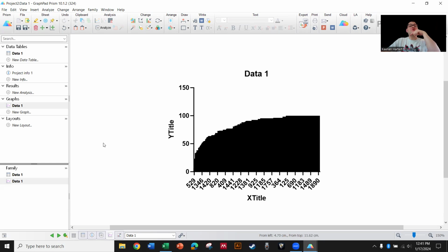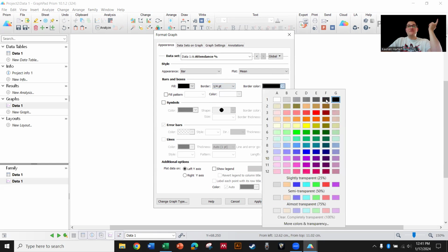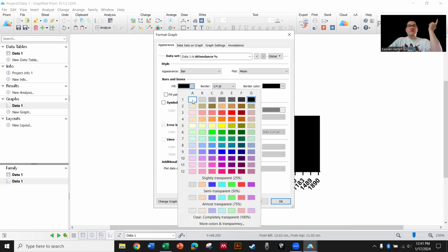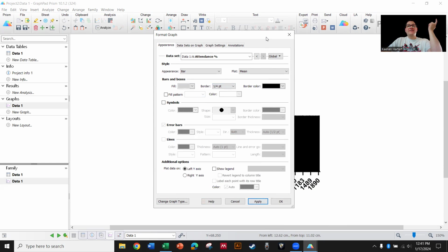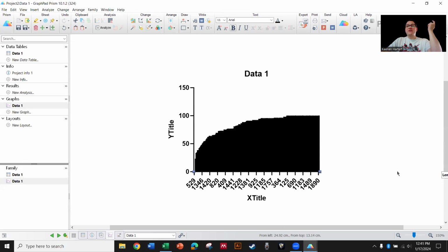I should have maybe reduced the population. Let's look into here. So first thing you can do if the things look a little dense, notice that the border is like 1/4 and it's kind of on top of itself. Border color, let's actually reduce these to some gray. That's still a lot, so it's not even showing up because we're just seeing the border in this case.